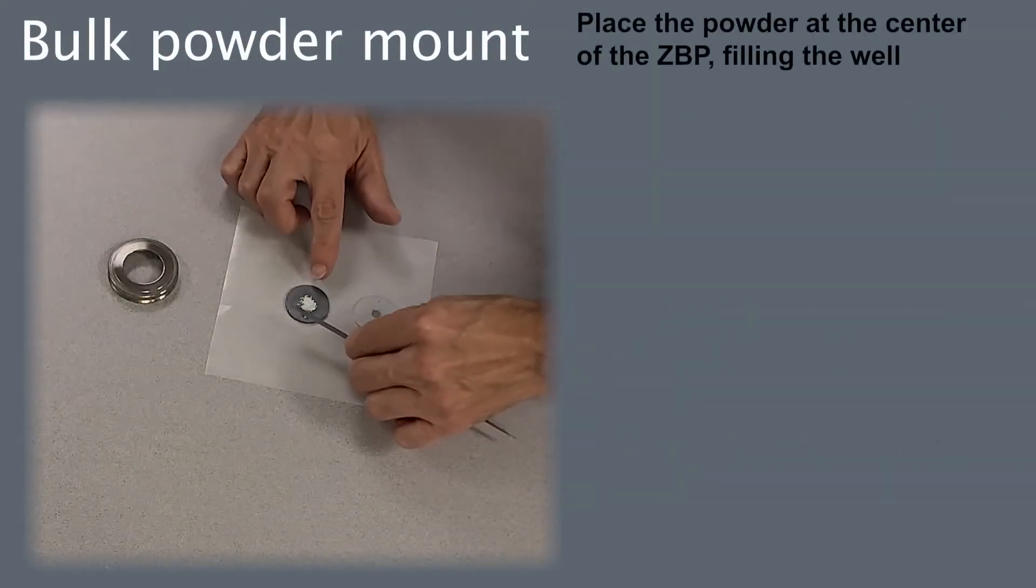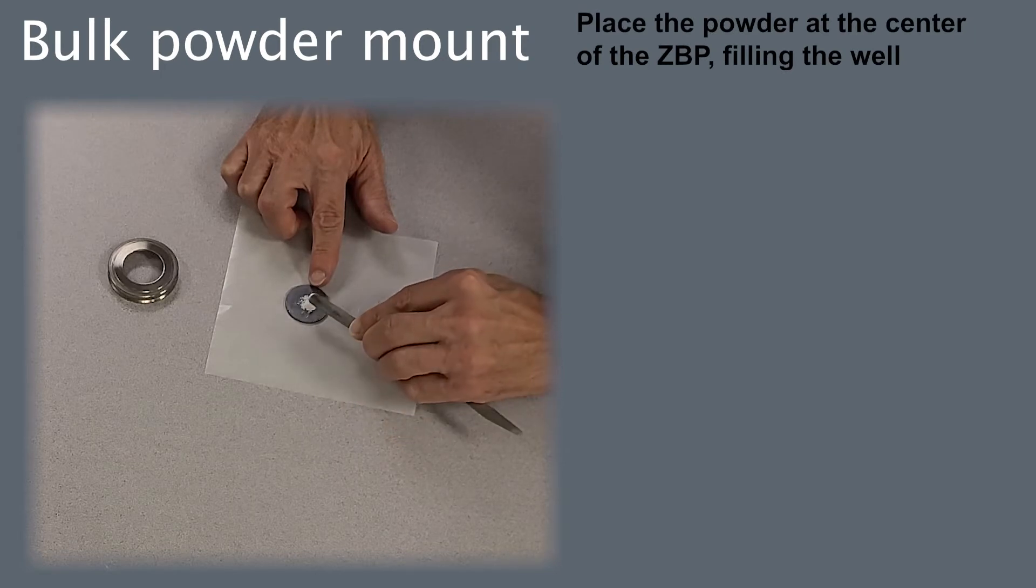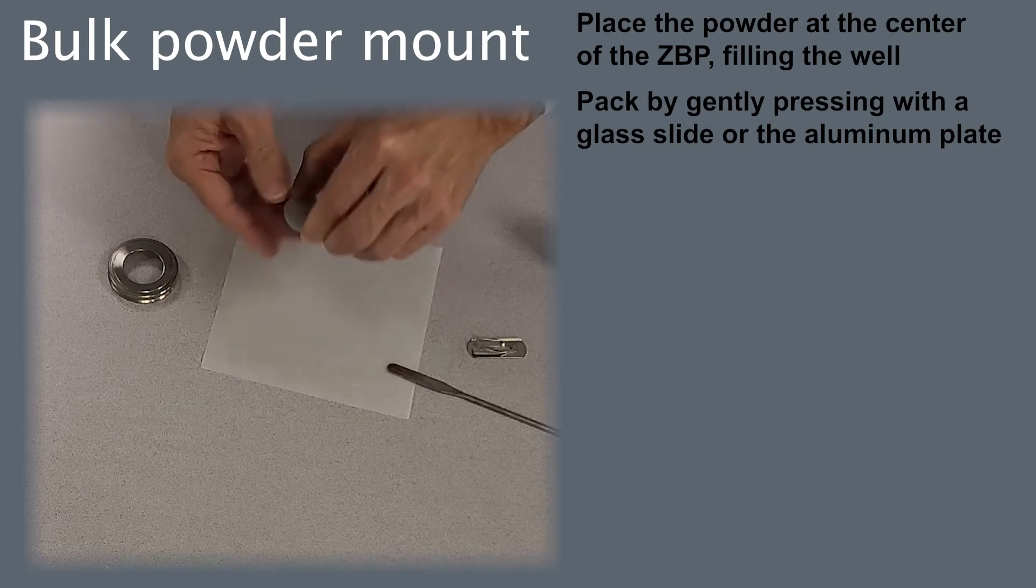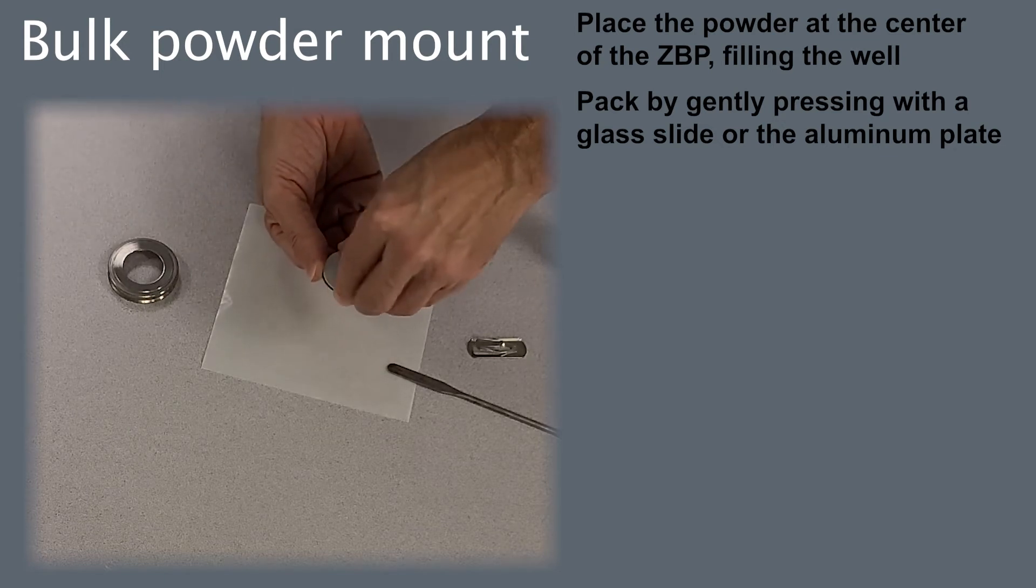To mount a bulk powder, place enough powder at the center of the plate to fill the well. Pack gently, pressing with the glass slides or the aluminum plate.